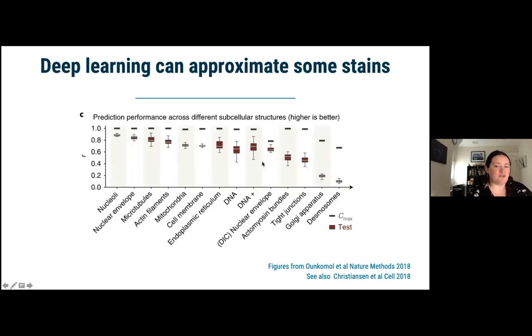And so for different organelles, this works to different abilities, but you could imagine somebody adding bright field measurements to an experiment and adding stain prediction in so that you could have more theoretical channels.